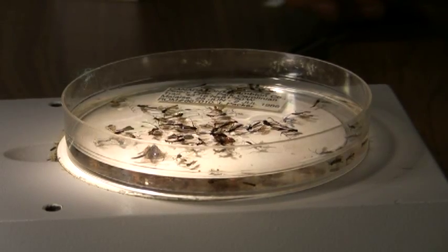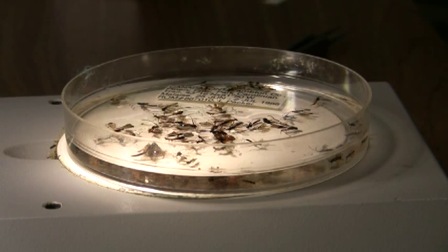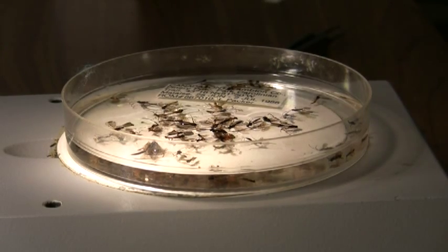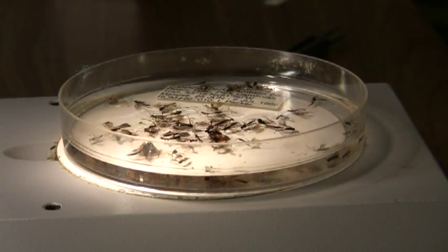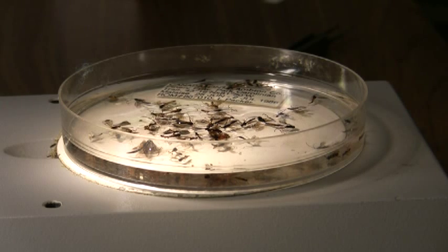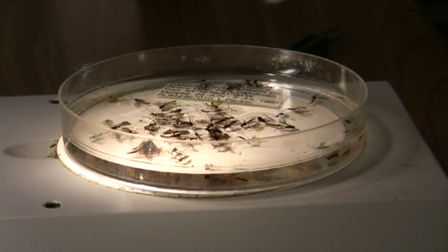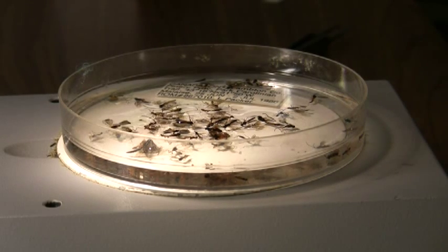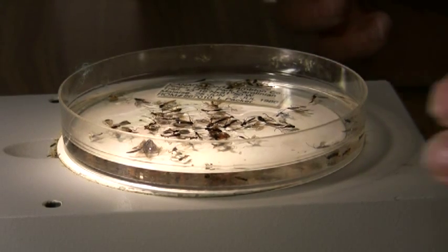Okay, I'd like to take a few minutes at the beginning of the lab today to show you another technique for mounting sort of intermediate sized insects. And this is relevant to your ichneumonids project because, as you'll see, a lot of the ichneumonids are in that size range where they're a little too small to directly pin, but they're very difficult if you were to point them. And card mounting, again, is a little bit difficult because they're fairly big for that as well. And what this technique involves is gluing the insects to the side of a pin.